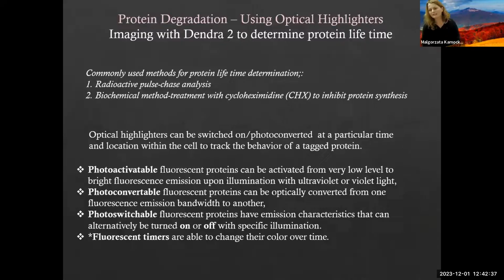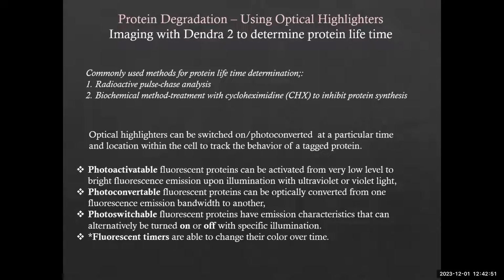All right, so if you have any questions regarding the tissue clearing techniques, I am happy to answer them now, because I will switch to protein degradation methods. Josie, there's a question in the chat. Yes. Which substances were used to clear the brain?